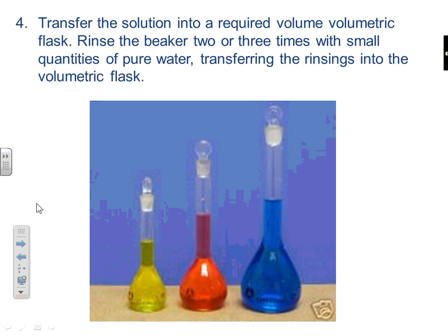So transfer it into the volumetric flask, rinse the beaker 2 or 3 times with small quantities of water, transferring the rinsings into the flask. So when you rinse, we want to keep all of those rinses in the flask. We want to get every last little molecule that was in that beaker into the volumetric flask.